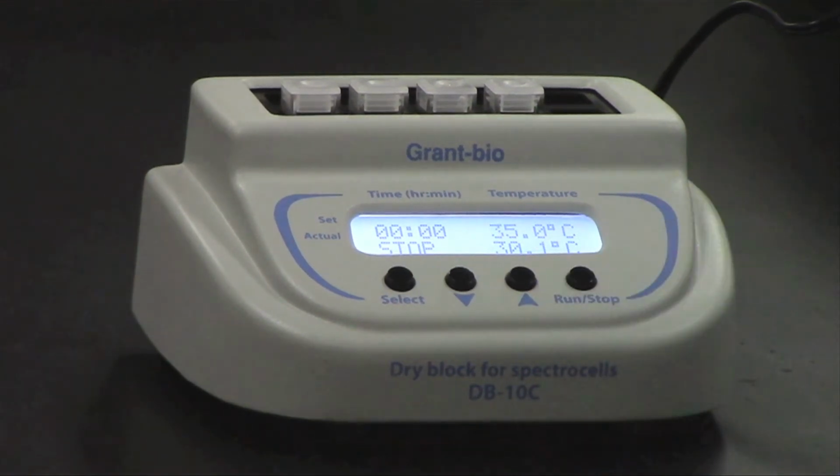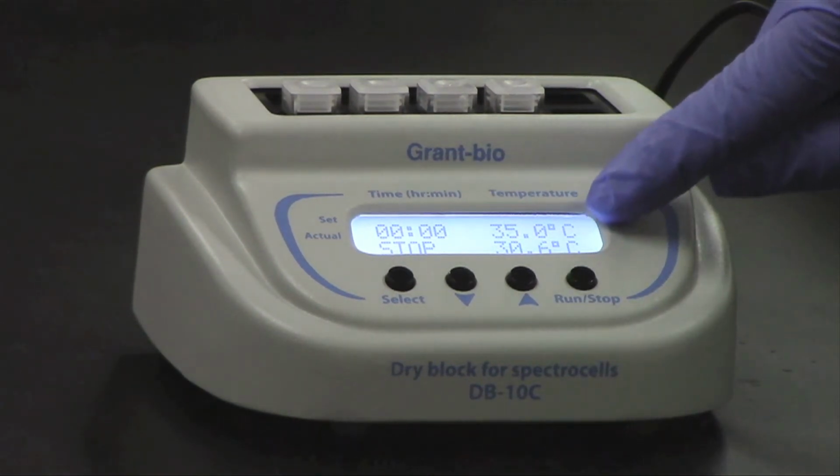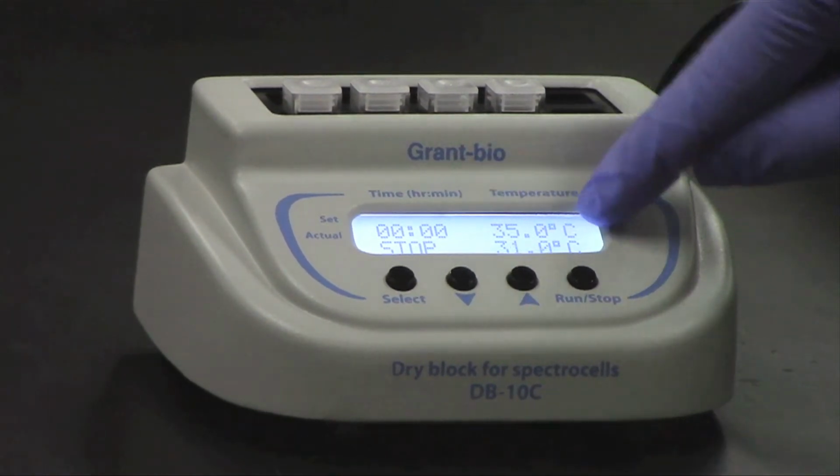And then click Run/Stop. And now you'll see the actual temperature is starting to go up until it gets close to hitting, or eventually hits, the set temperature.